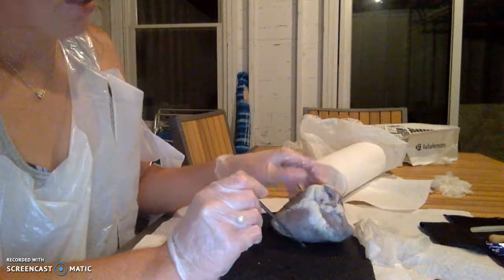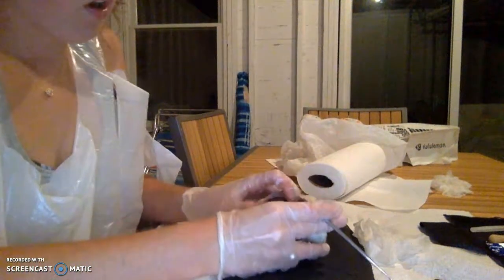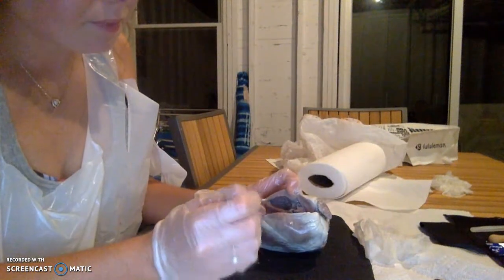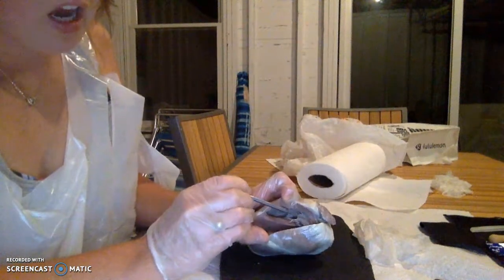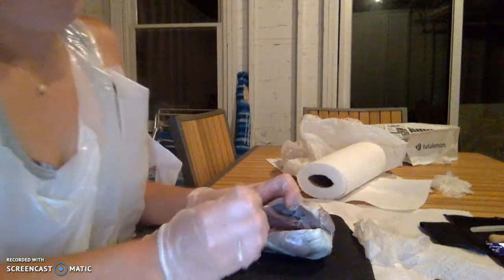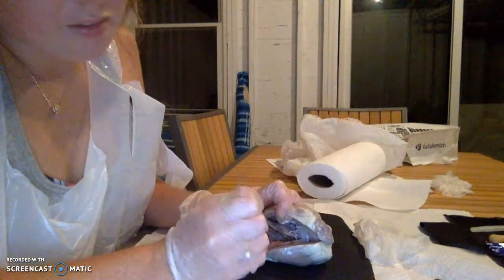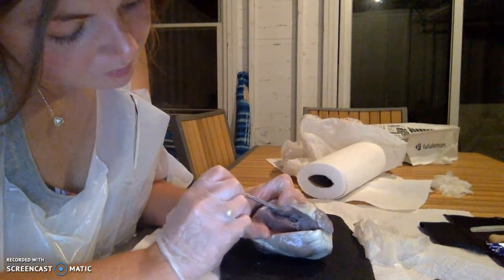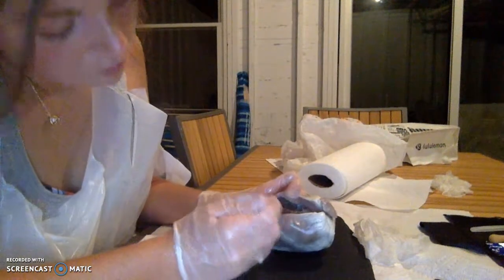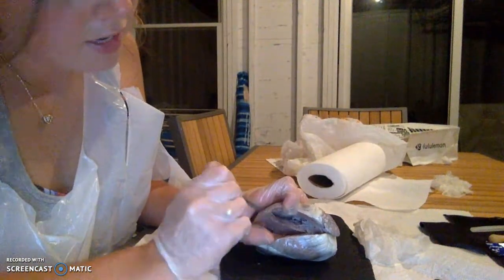And so now I'm going to move on to the right side of the heart. This is the interventricular septum. So to start, it's so hard to pull the right side apart. So you have the right atrium up here. You have the right ventricle down here. You have the chordae tendineae right here.